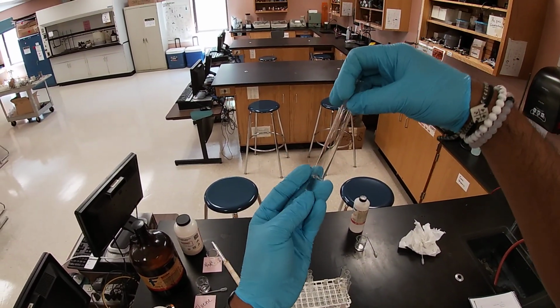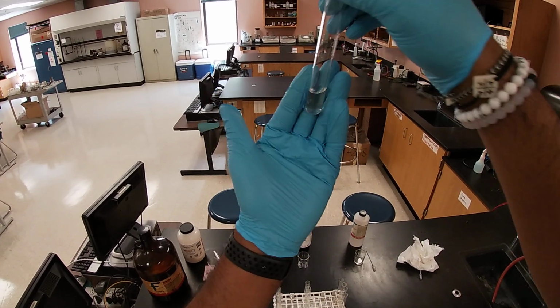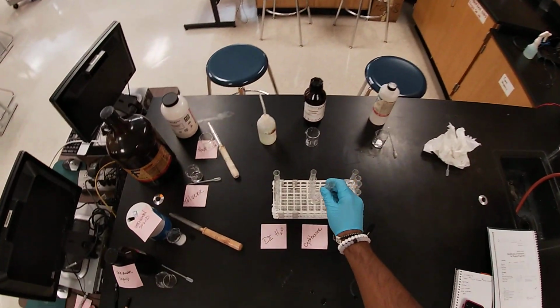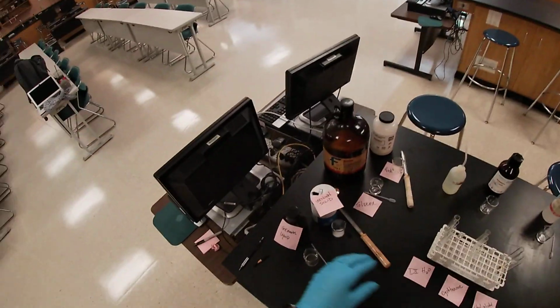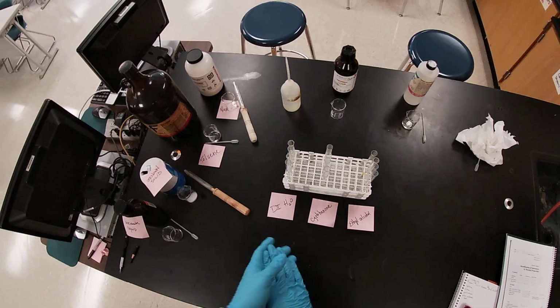For cyclohexane and the unknown liquid, there are no two layers, so that means that the unknown liquid is soluble in cyclohexane. And then lastly, the unknown liquid in ethanol is also soluble in it, whatever this liquid is, okay? And so those are the solubilities.